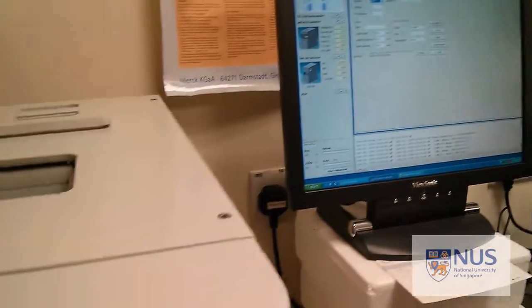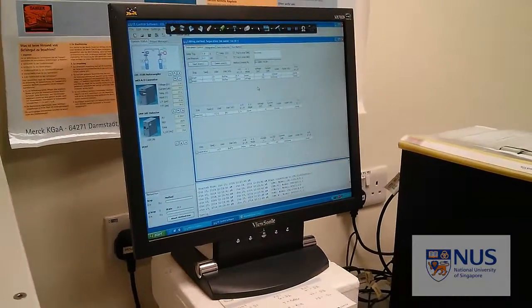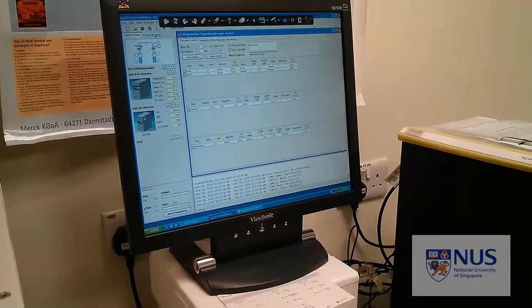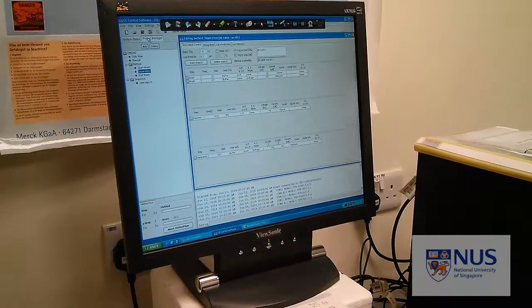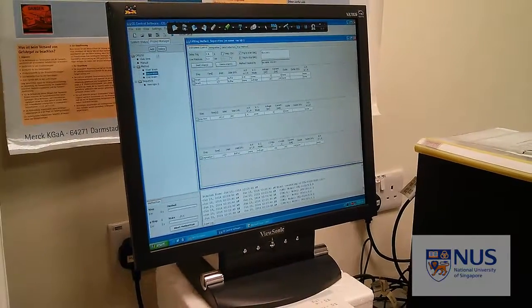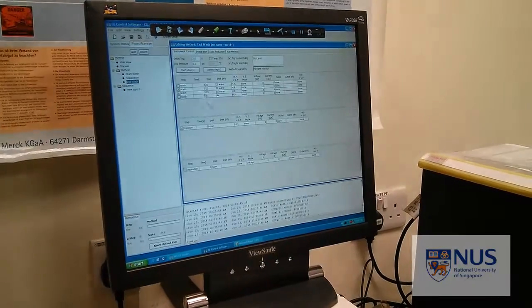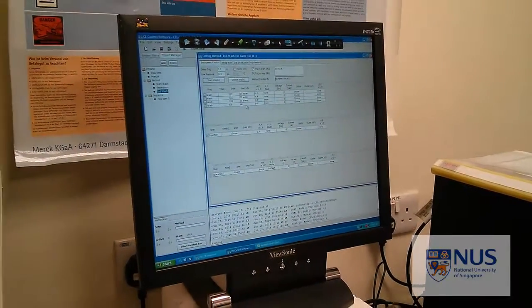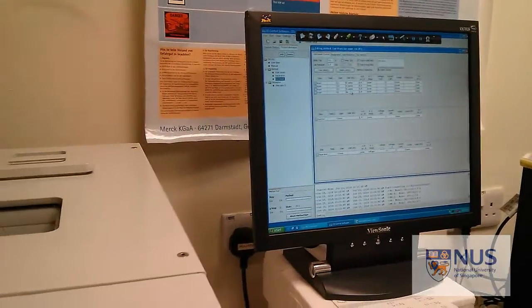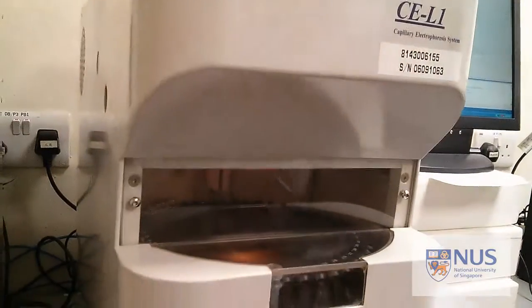We won't go into that now. We'll imagine that you've just finished all your samples and you need to do an end wash before you shut down the machine. So you go back onto Project Manager here at the top, end wash, and you can see again here that we've got all our timings. Do we need to lower the sample holder? Yes, we do. So we've got our DI water here again and air.